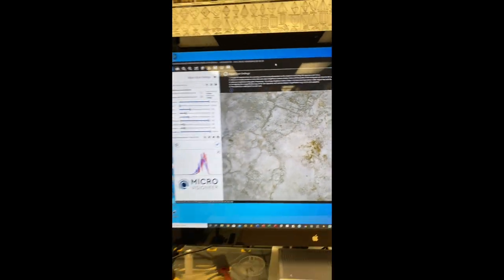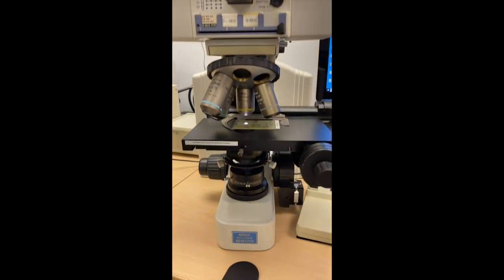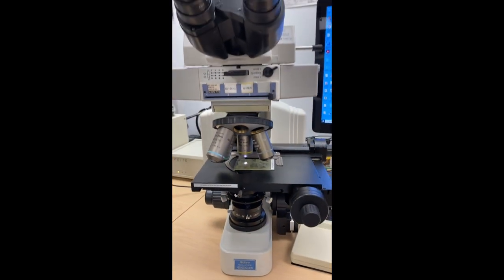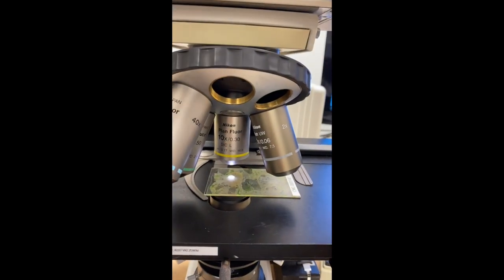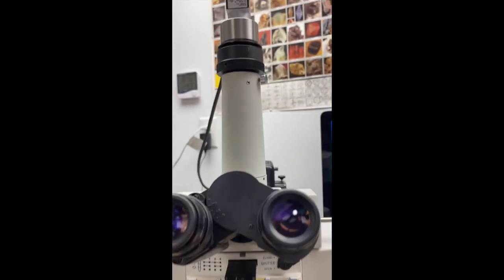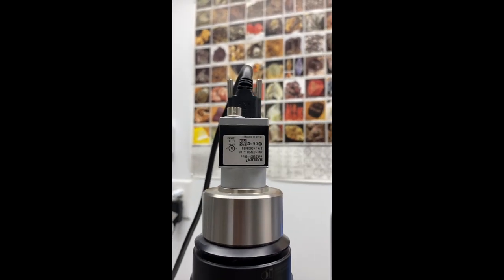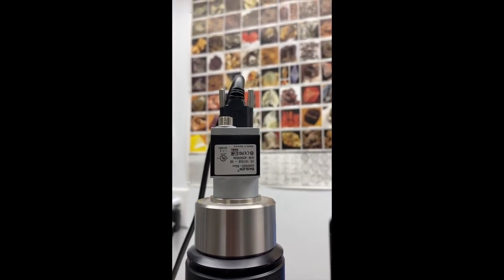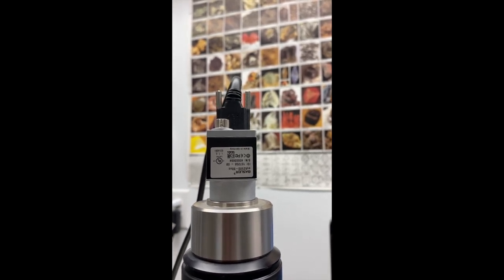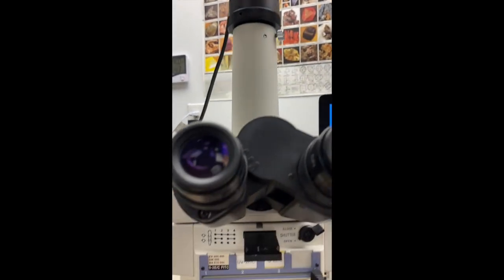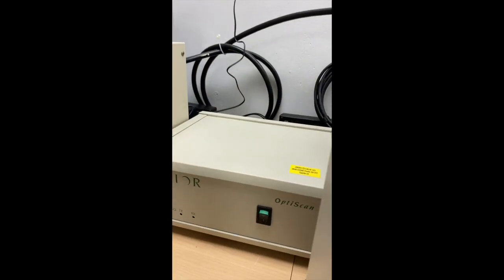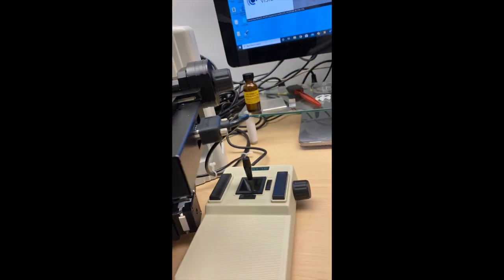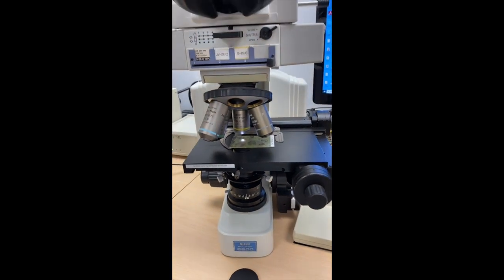I'm using a Nikon Eclipse E600 fluorescent light microscope with 10x objective and a Basler S camera with 60 frames per second frame rate, 5 megapixel, and the Prior controller, the OptiScan controller, the joystick, and the motorized XY stage.